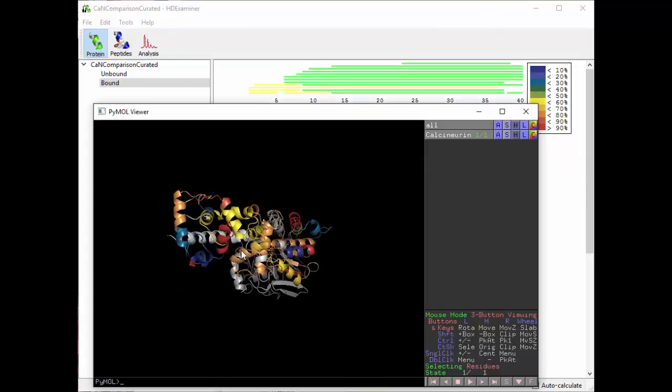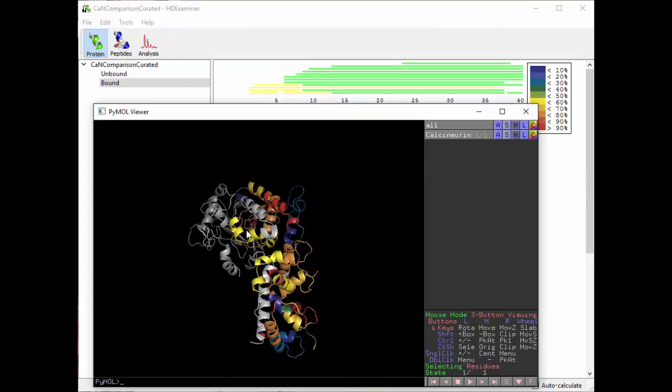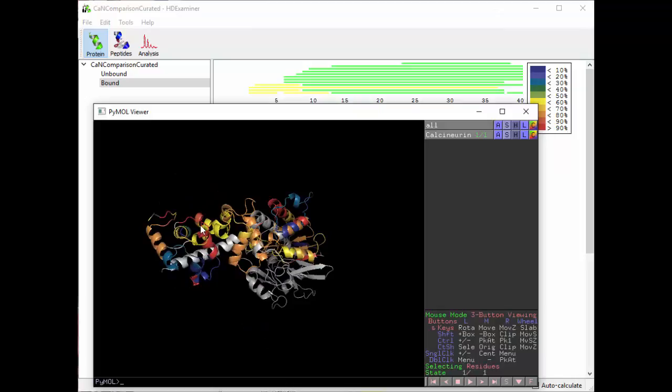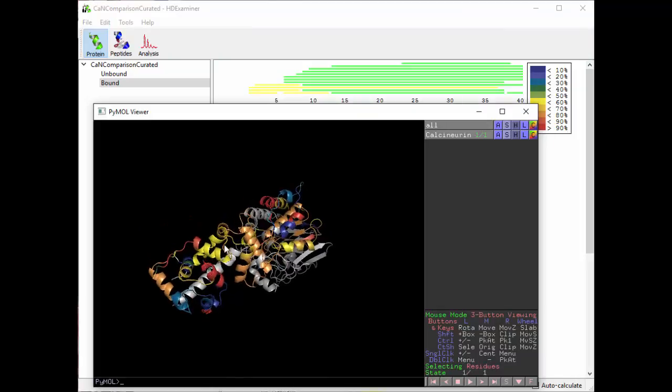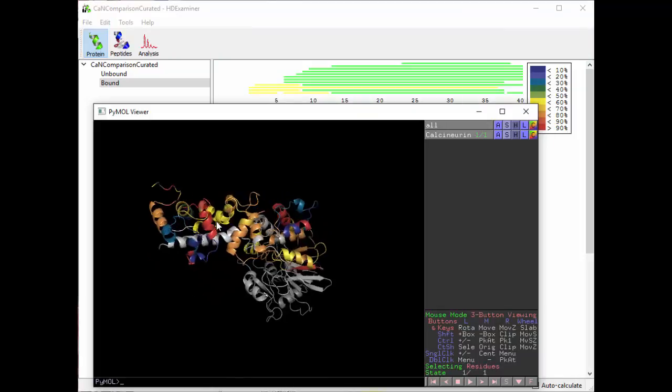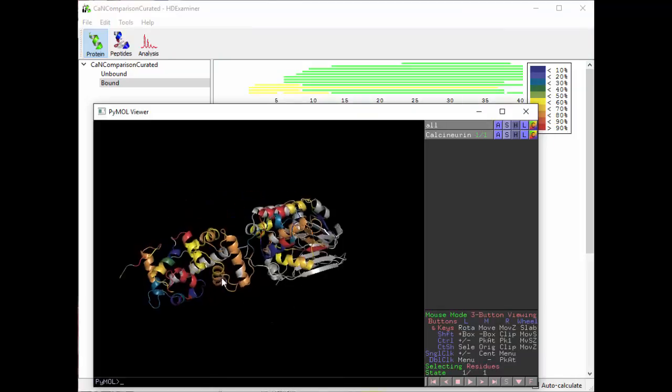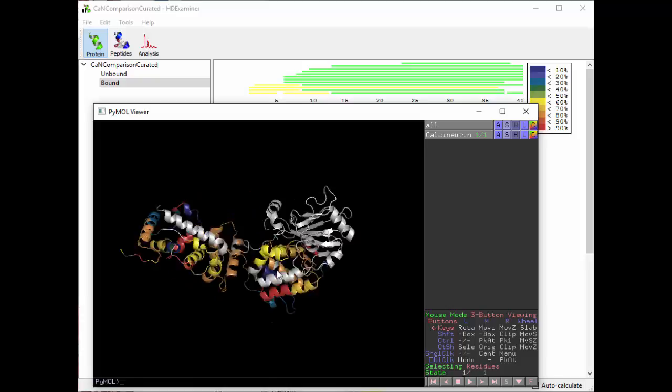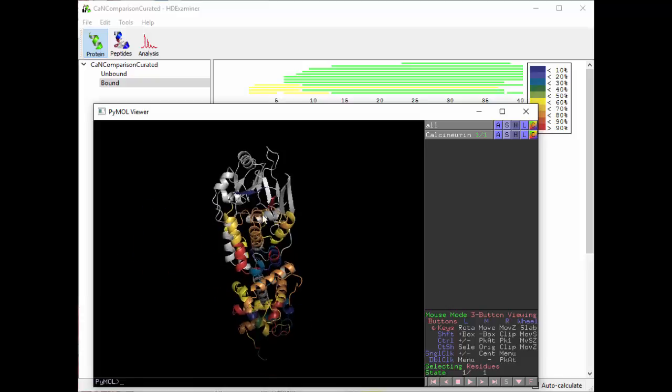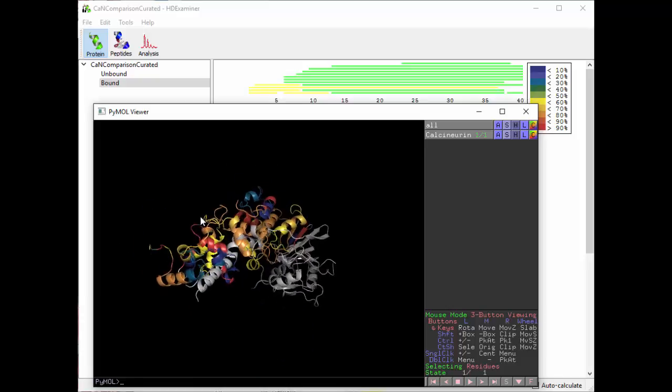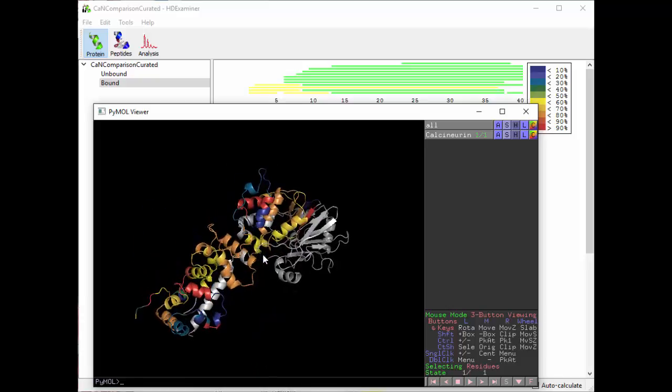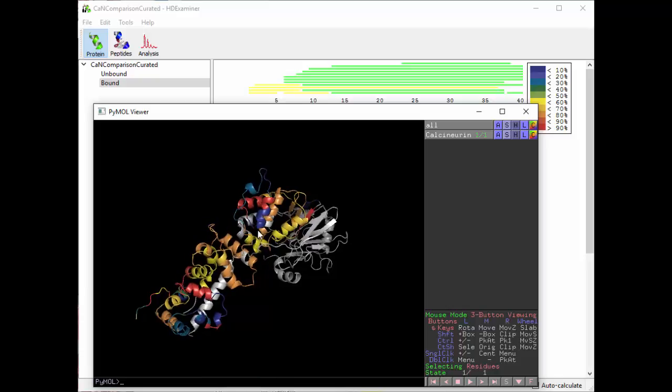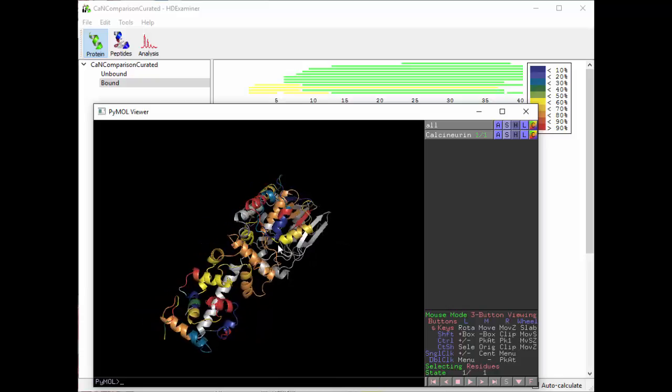So that's it. From here in PyMOL you can export things. You can move the protein around however you like and then take a snapshot and save it as a file that you can put on your poster. Any of those things are fine.